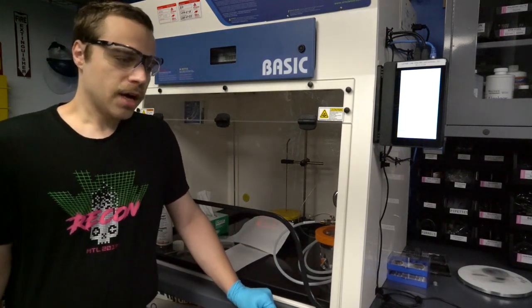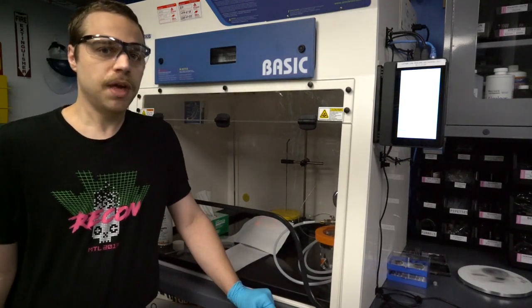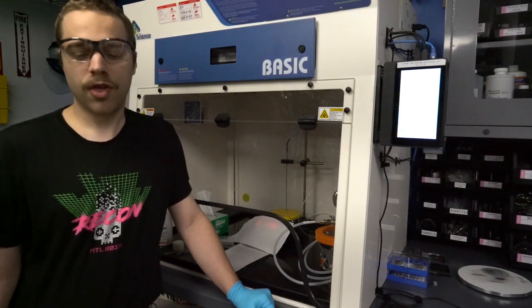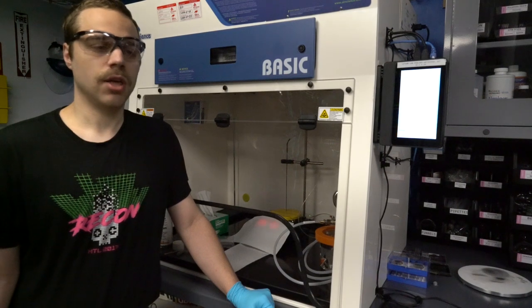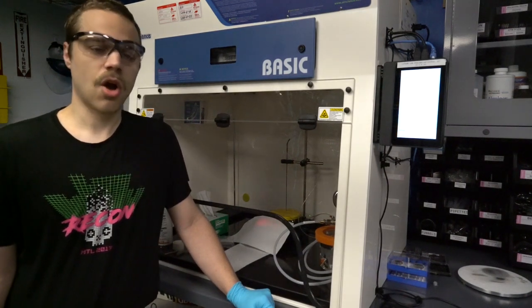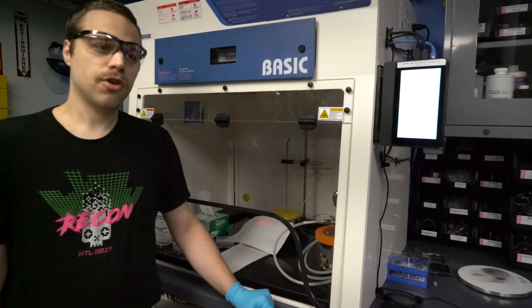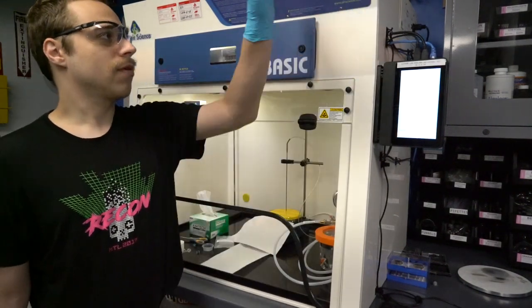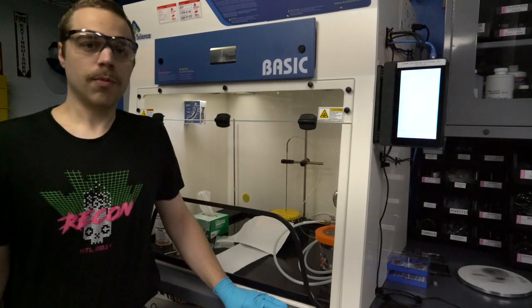Speaking of epoxy, it's definitely not good to be breathing it. There are all sorts of nasties in both the resins and the hardeners that you really don't want to be inhaling or getting on your skin. So definitely safety first — proper PPE, eye protection, gloves — and work in a ventilated area or ideally a fume hood.